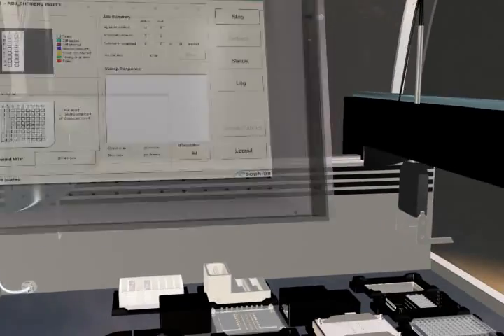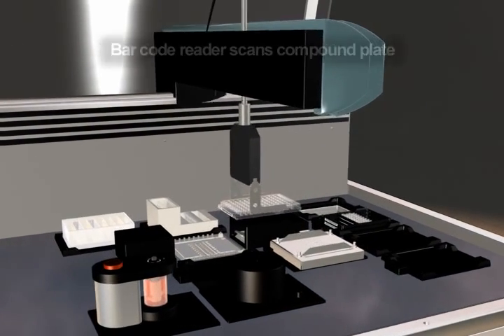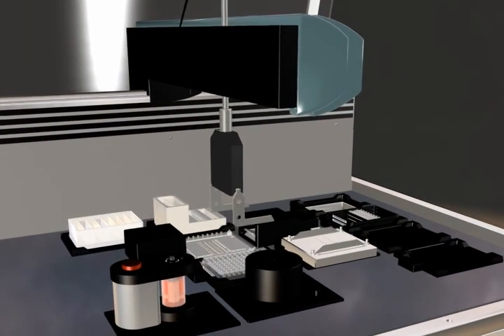To start, the robotic gripper arm picks up the compound plate for barcode scanning. The plate contents are confirmed and recorded to the database.